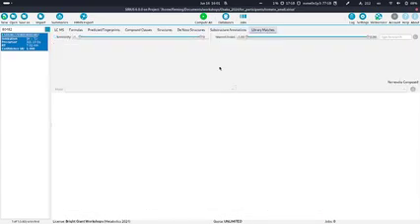Okay, the next step would be the library matches, which we showed already in the slides. That is now possible to see if we actually have a hit in a reference spectrum database. For this particular compound, we don't have any match, but I will show you soon an example where we have a match. Okay, so now we went through everything, or mostly everything.